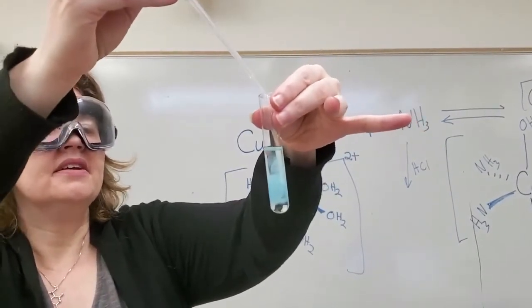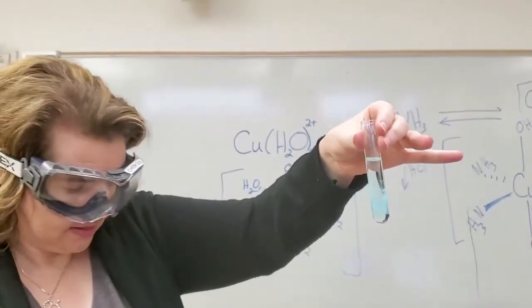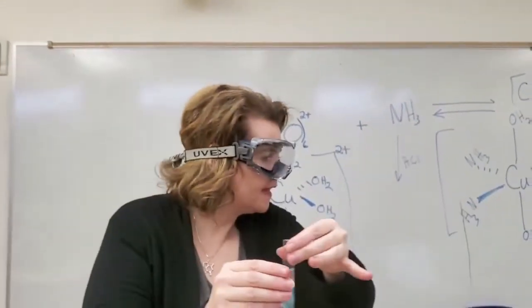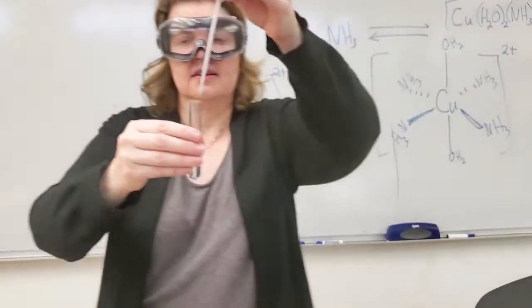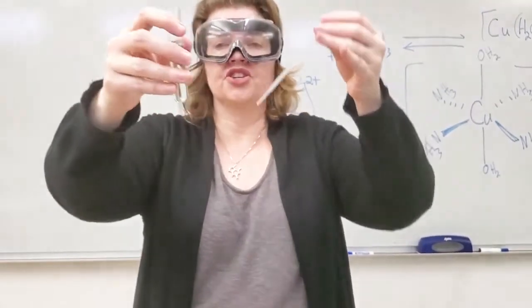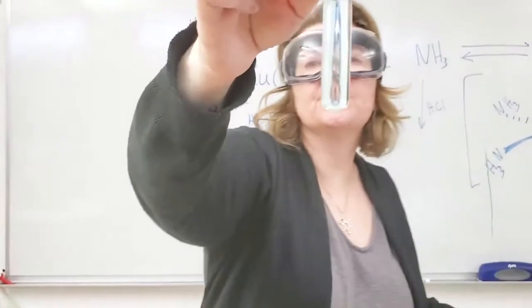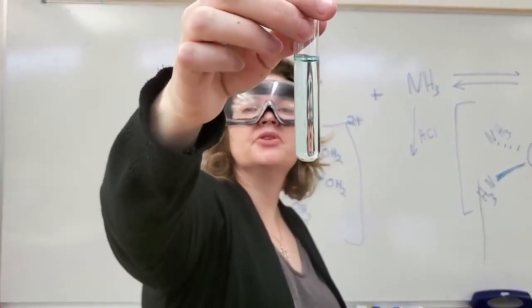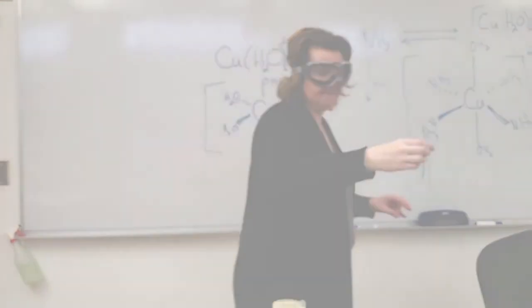And if I keep going, let's see if that's enough. We're back to my original copper complex with just water. Okay.